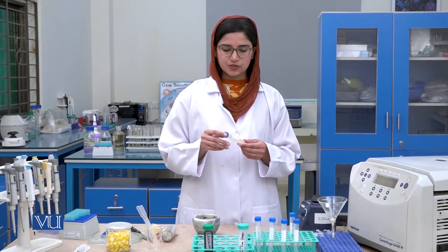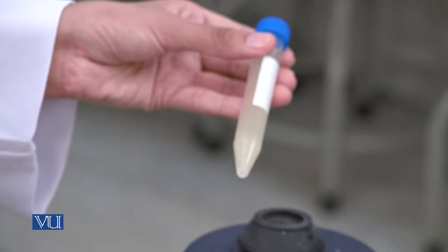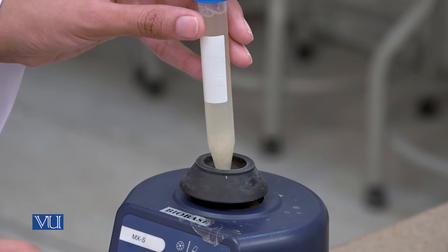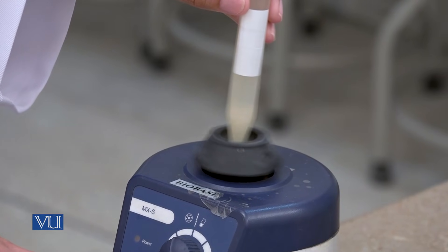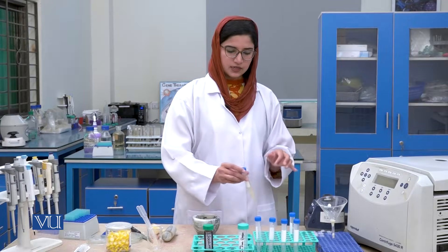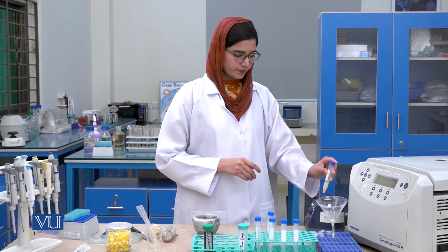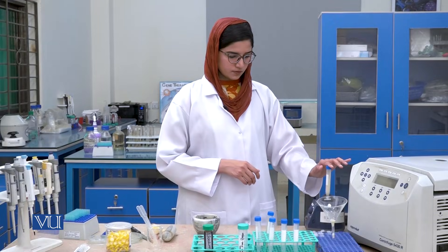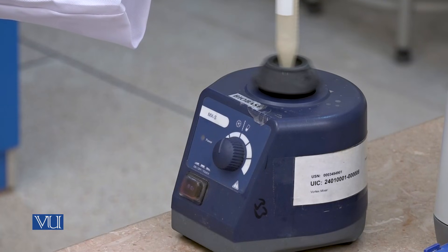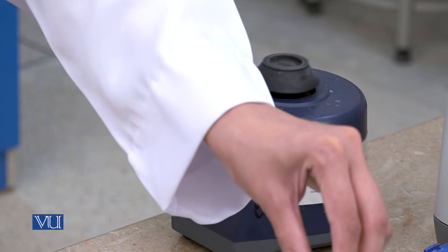After transferring the solution into the centrifuge tubes, we will vortex the solution with the help of a vortex mixer. Similarly, we will vortex the other centrifuge tube as well. After vortexing, we will turn off the vortex and proceed to the next step.